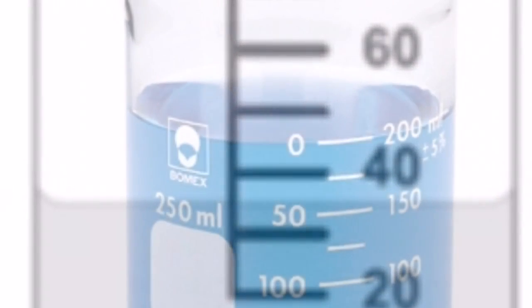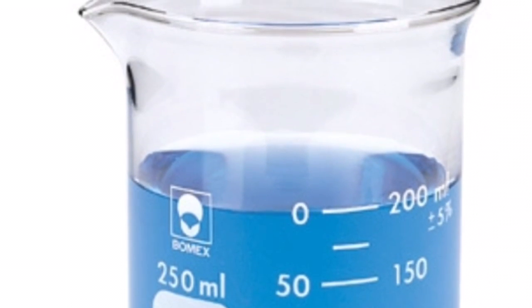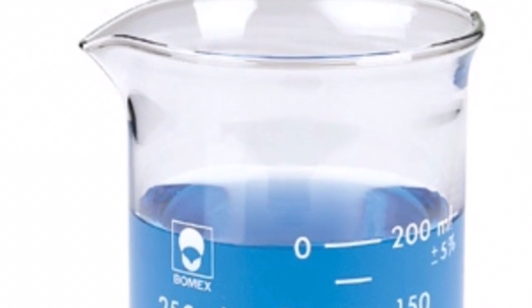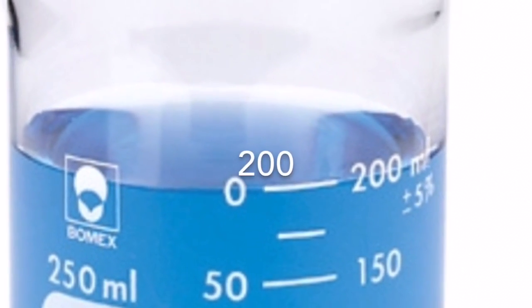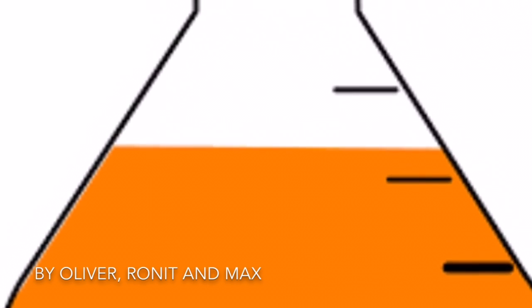Here are some examples of water measurements. See if you can tell what the milliliter value is. Most common mistake is referring to the left-hand number when measuring with the beaker. You should always refer to the right-hand number when measuring with the beaker. Hopefully you now know a little bit more about beakers and flasks.